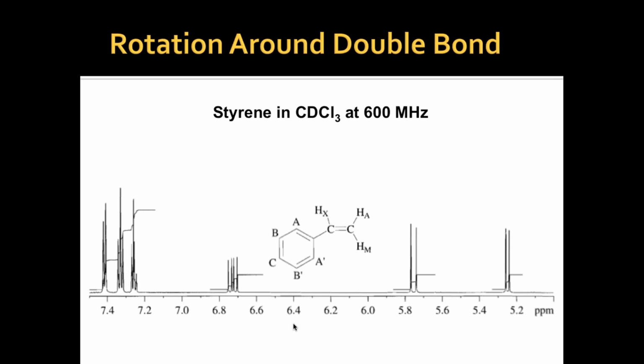So from this, first of all, identify the molecule: you have some aliphatic, you have some aromatic, right? Easy. Aliphatic means below 6 or 7, and above 7 is aromatic. So above 7, you can see some aromatic peaks, and you can see some aliphatic peaks. Now for the aliphatic peaks, remember one thing: above 5, if there are some aliphatic peaks, that mostly belongs to the double bond or triple bond kind of stuff, right?